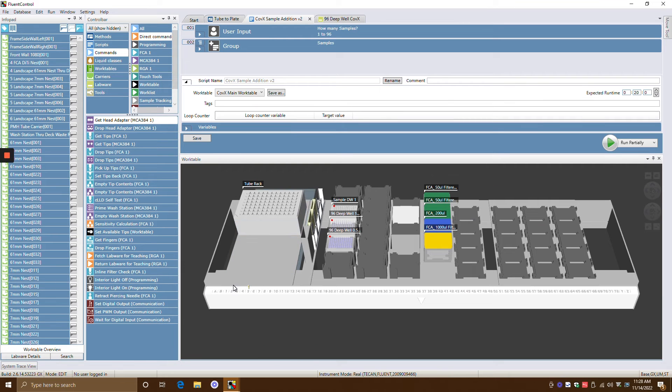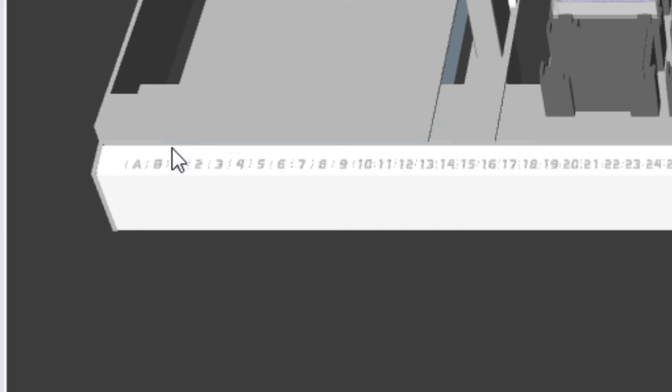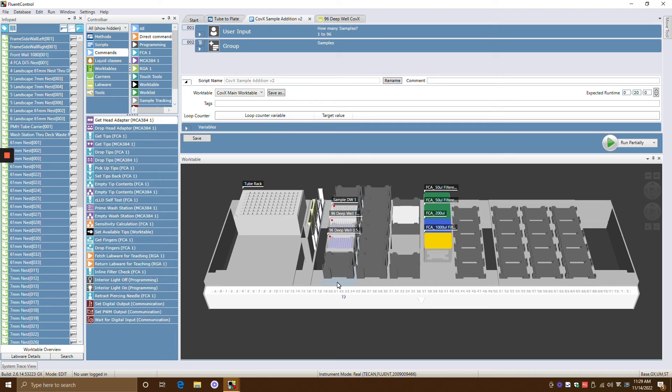The way that carriers and labware is arranged is by these grid positions right here. So you can see here it starts with A, B, and then 1, 2, 3, 4, 5, 6, 7, and blah, blah, blah, all the way to Z.